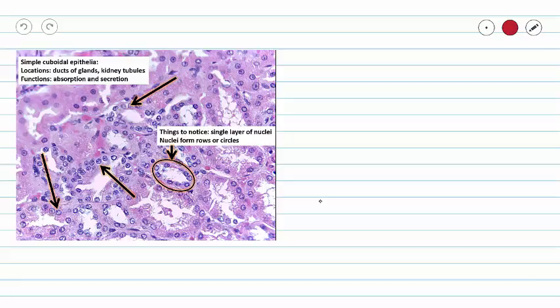So sometimes it's not completely easy to see but here is our lumen, that's our white space. And surrounding our lumen we have one layer of cells. And then we can just pretend that there are dividing lines between these cells. And we've got some square cells with nice round nuclei right in the middle. This is a great picture to look at but let's take a look at some more.